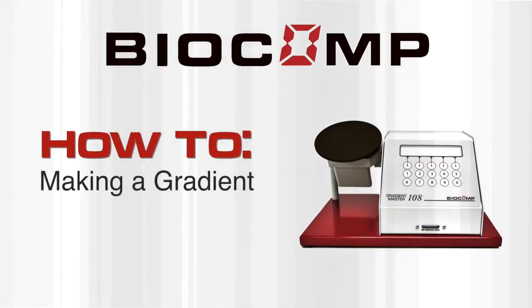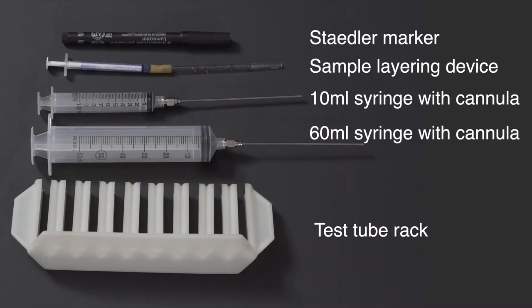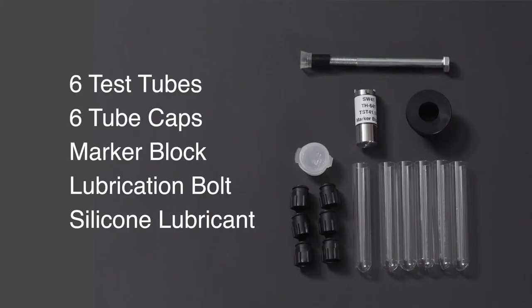Step 1: Gather the necessary items, including a Staedtler marker, sample layering device, 10 milliliter syringe with cannula, 60 milliliter syringe with cannula, test tube rack, heavy solution, light solution, six test tubes, six tube caps, and a marker block.